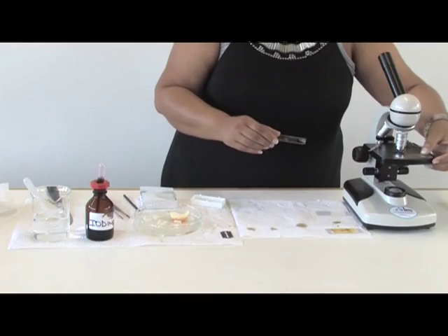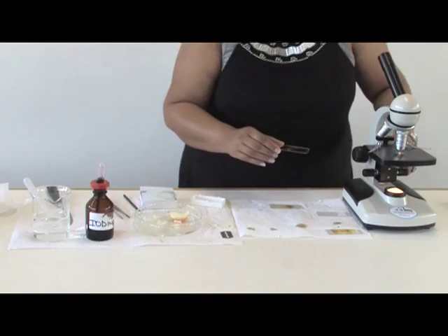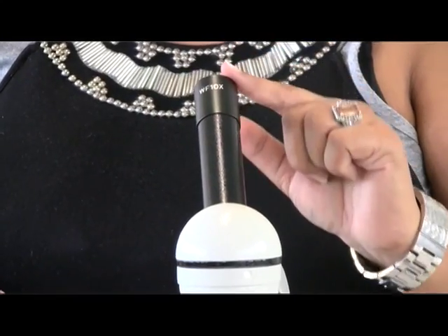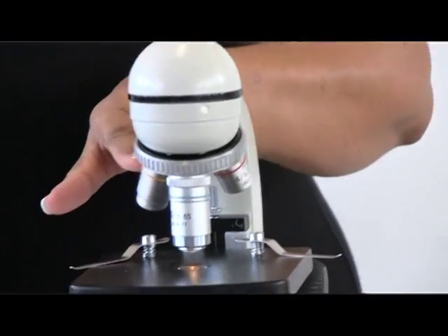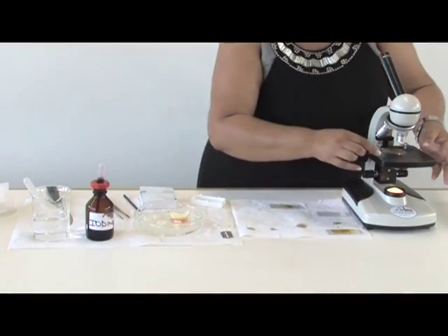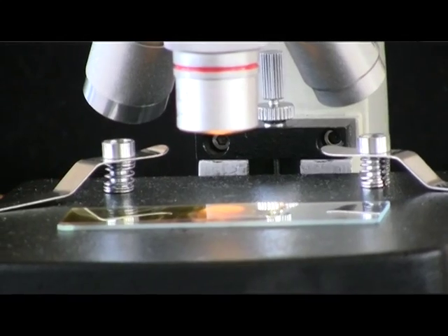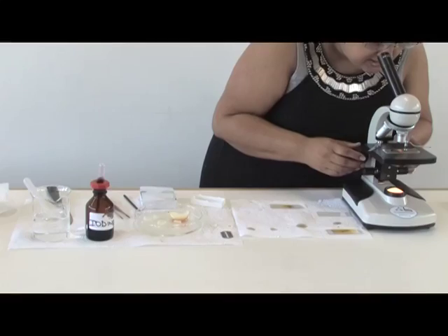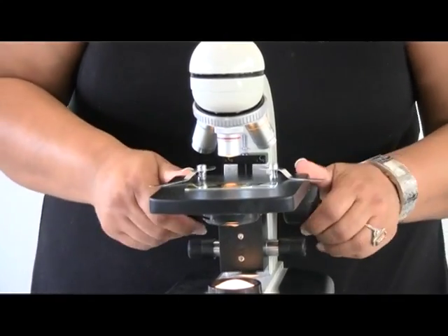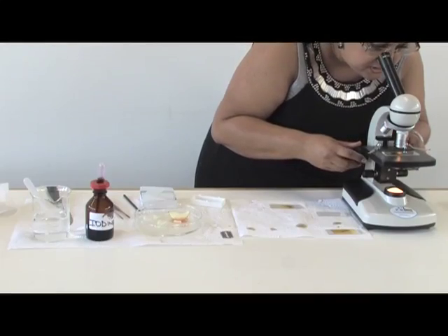Then you go to your microscope. You have your eyepiece, and normally your eyepiece will indicate the type of magnification that you use. You also have your three objective lenses. You normally start with the smallest, which is the four times magnification, and you start focusing until you see something. If you can see the cells — even the nucleus inside — you can go to the next magnification of the objective lenses and focus once again.